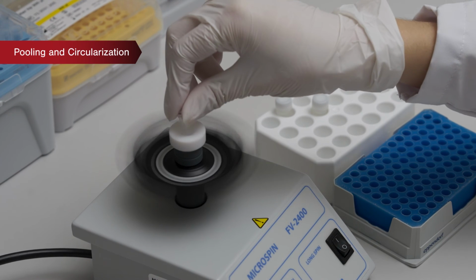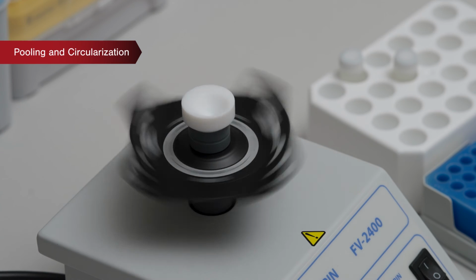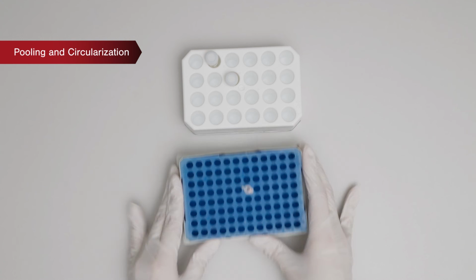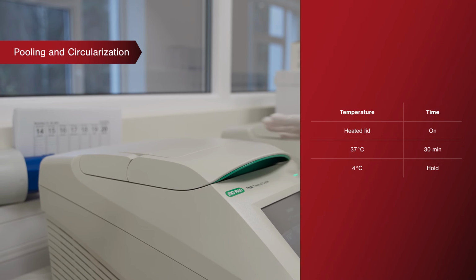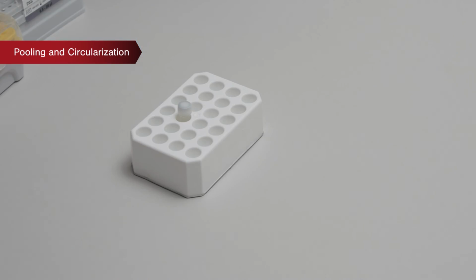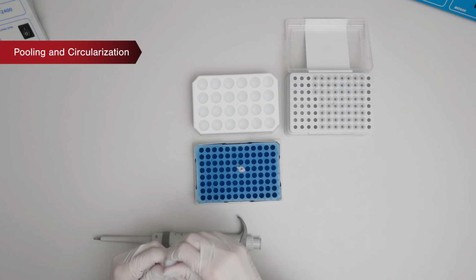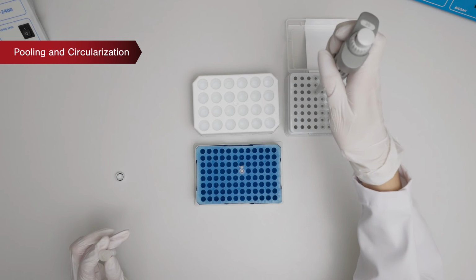Then 4 microliters of enzymatic digestion mix is added to the circular products from the previous step. Samples are vortexed 3 times for 3 seconds each and centrifuged. After that, samples are placed in the thermal cycler in the following conditions. It is important that immediately after the reaction is finished, 7.5 microliters of digestion stop buffer is added to the samples to stop the digestion reaction.